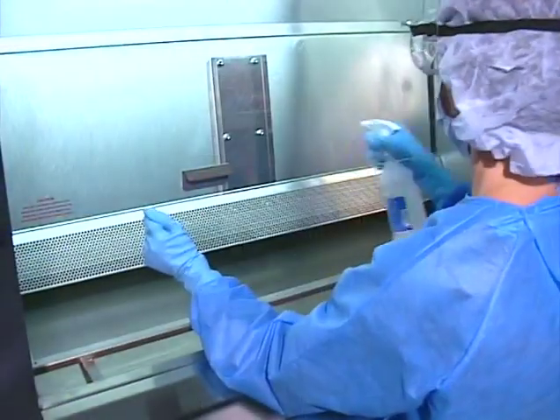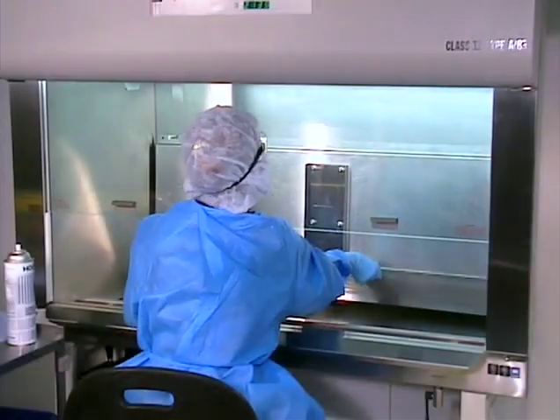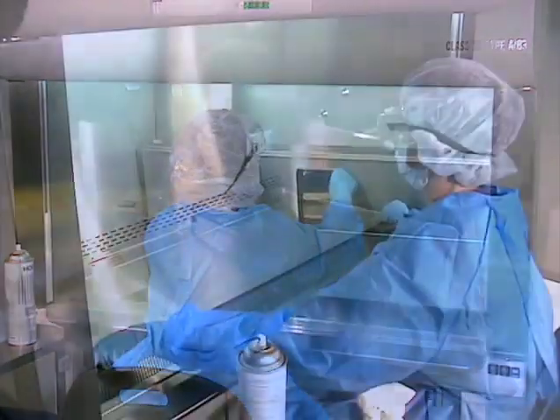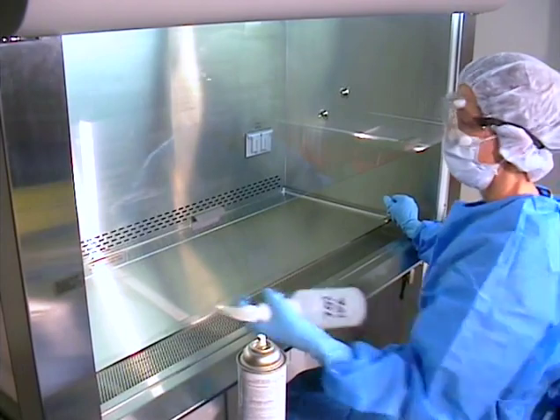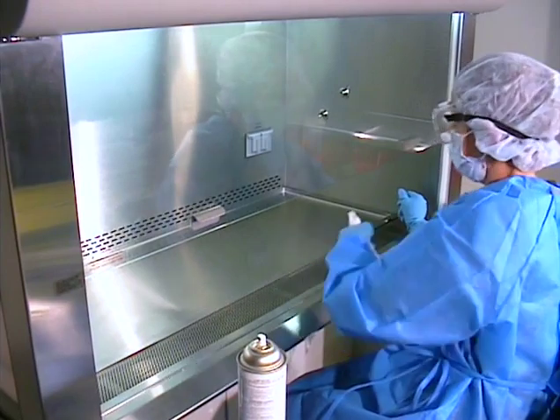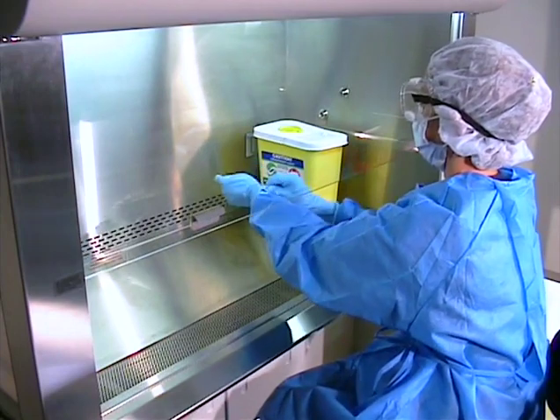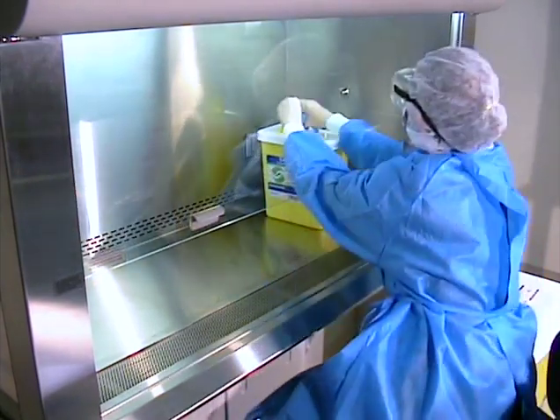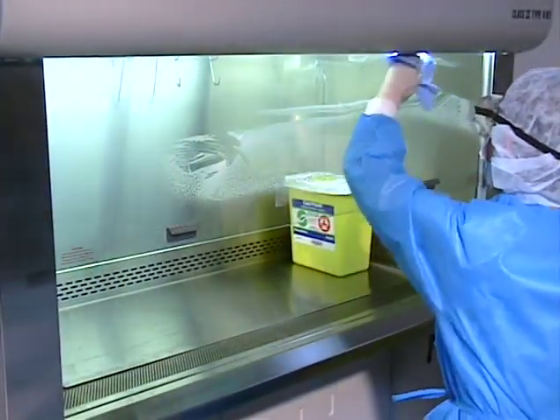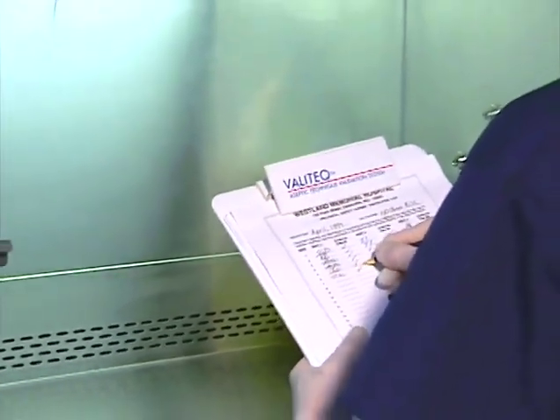Disinfect the under tray area and the backside of the work tray and grills. Return them to their normal position. Disinfect the rear and side walls of the upper work surface with alcohol. Place a new waste container in the hood and remove the outer gloves. Dispose of them in the new waste container. Clean the outside of the view screen. Deglove and degown properly and log all cleaning and disinfection activities as required in your standard operating procedures.